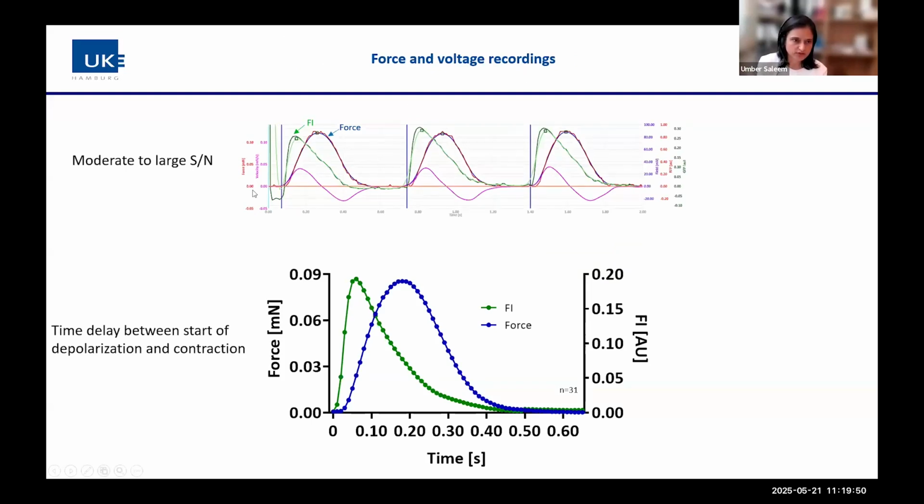Force and voltage recording with this sensor showed moderate to large signal to noise ratio. And the average peak of voltage, which is indicated by fluorescence intensity, and force showed a characteristic time delay between start of depolarization and contraction.